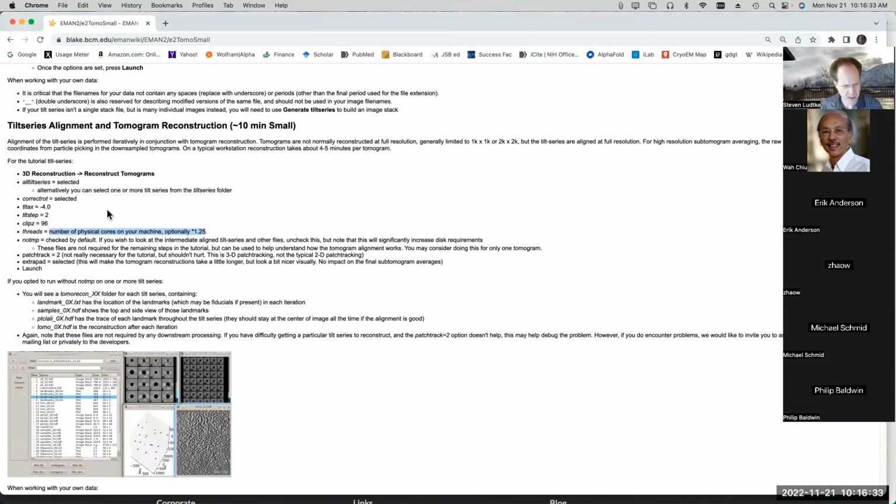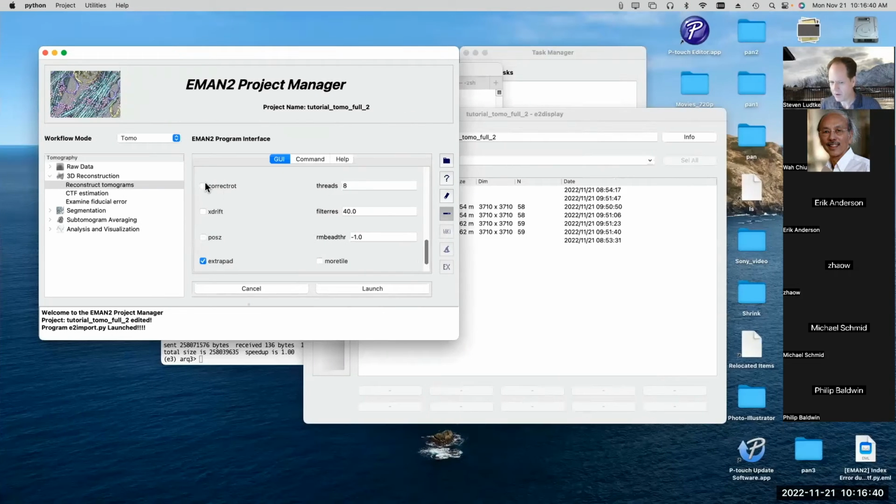I think actually that it suggests, yeah, so it wants you to turn that on here if you go through the tutorial. For single particle specimens, this is very useful. For things like lamella or cellular specimens, it's a lot less useful because the landmarks that get picked could be in a bunch of different planes. So the actual rotation you get out of this in thicker specimens with landmarks all over isn't necessarily going to be a good one. So I normally don't use that for cells.